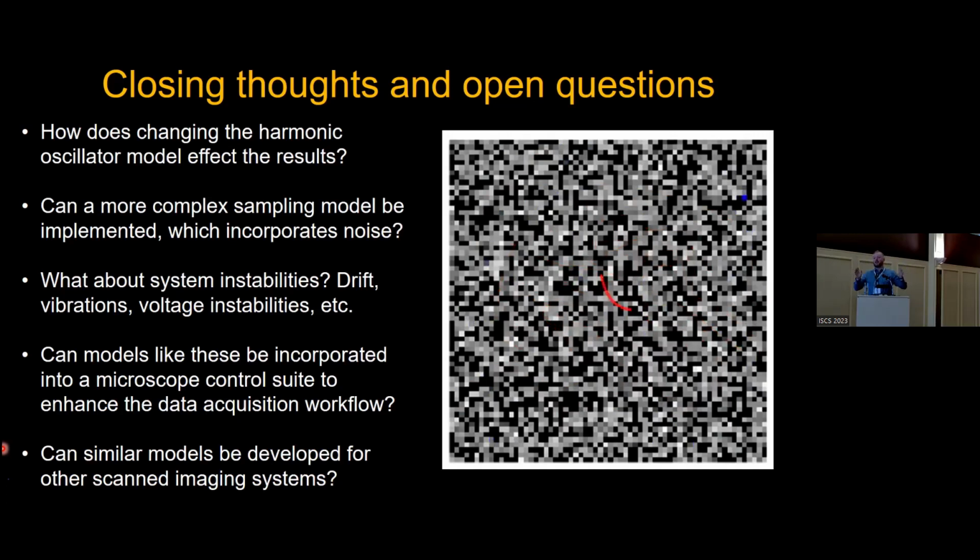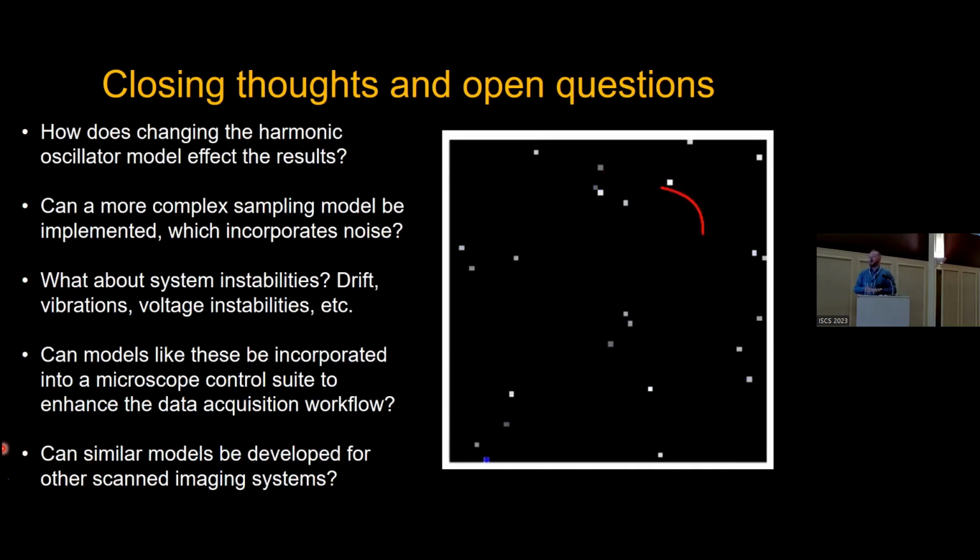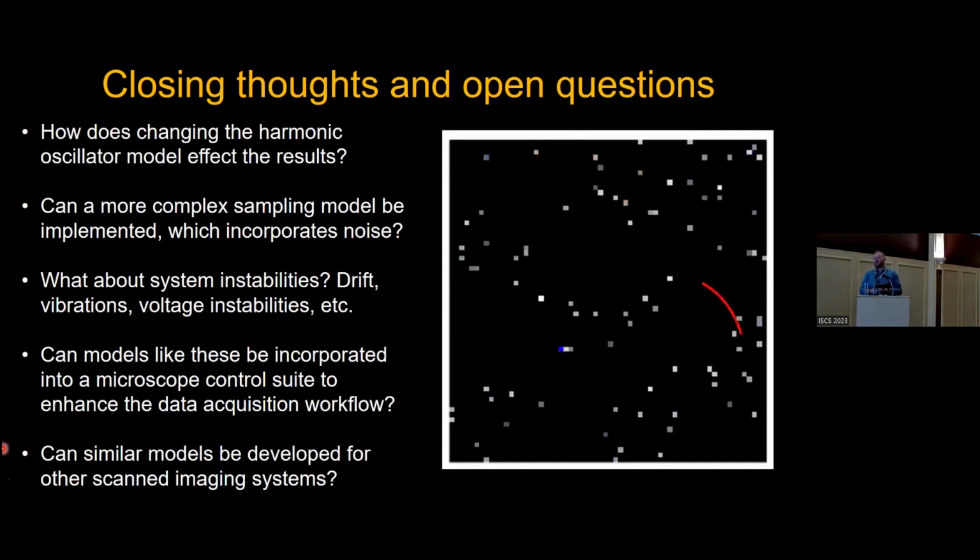And it's a non-linear phase amount across the image. So on the left edges, it's different to in the middle. And so you have to take that into account if you do any fixes. There is a paper that does that though. So there is some work in that regard because we're looking for solutions to this timing constraint on raster scanning.